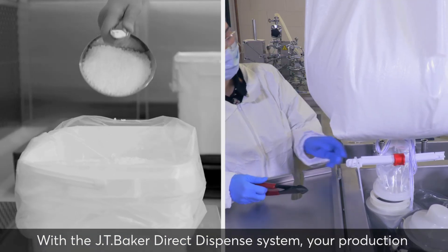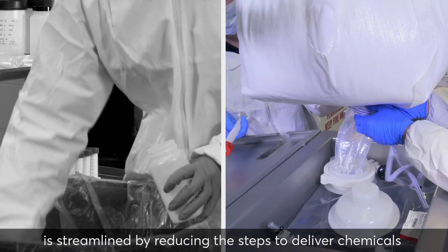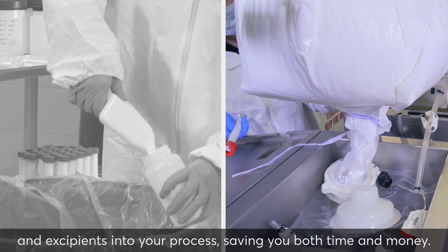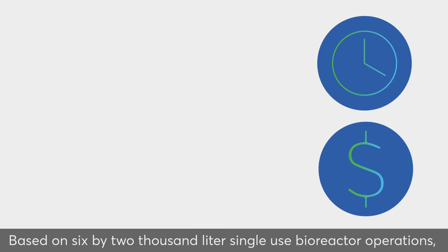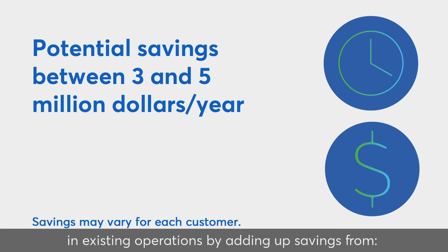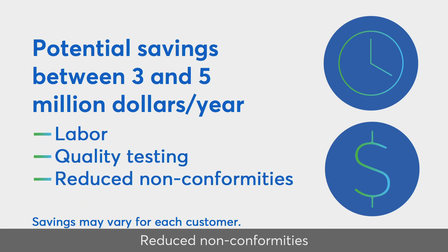With the JT Baker Direct Dispense System, your production is streamlined by reducing the steps to deliver chemicals and excipients into your process, saving you both time and money. Based on 6-by-2,000-liter single-use bioreactor operations, customers have saved between $3 and $5 million per year in existing operations by adding up savings from labor, quality testing, and reduced nonconformities.